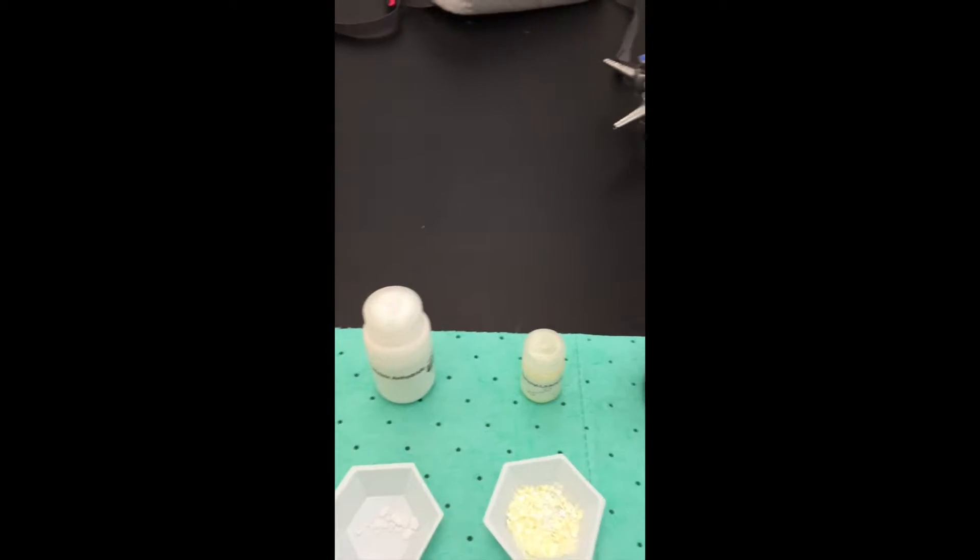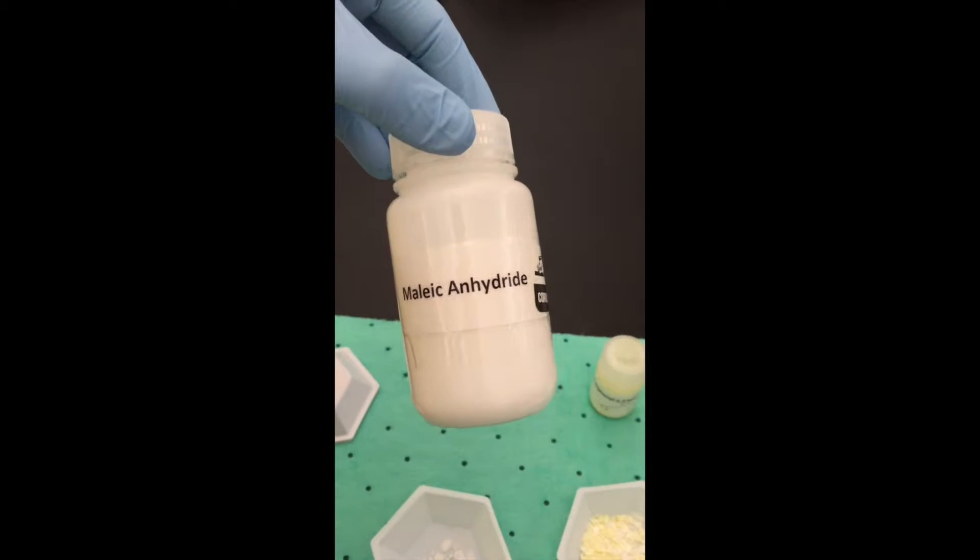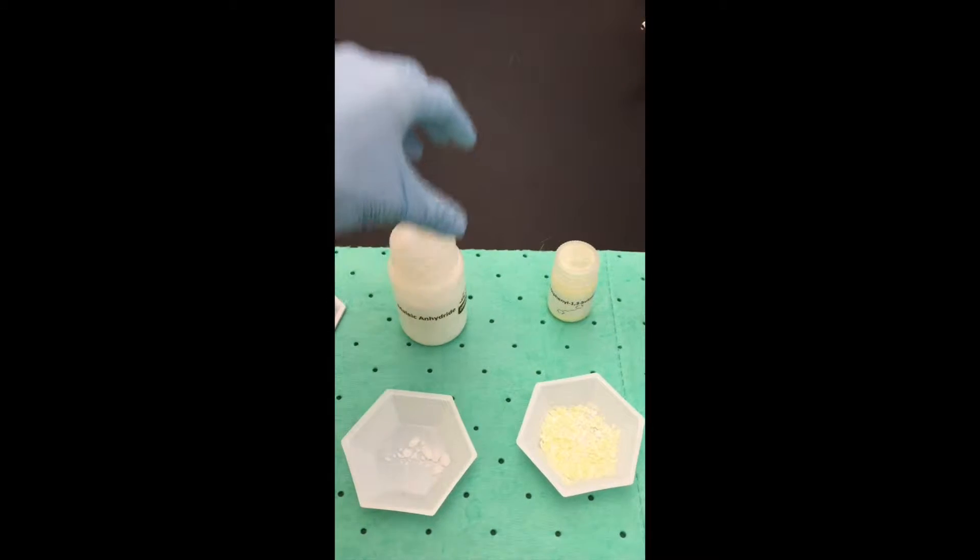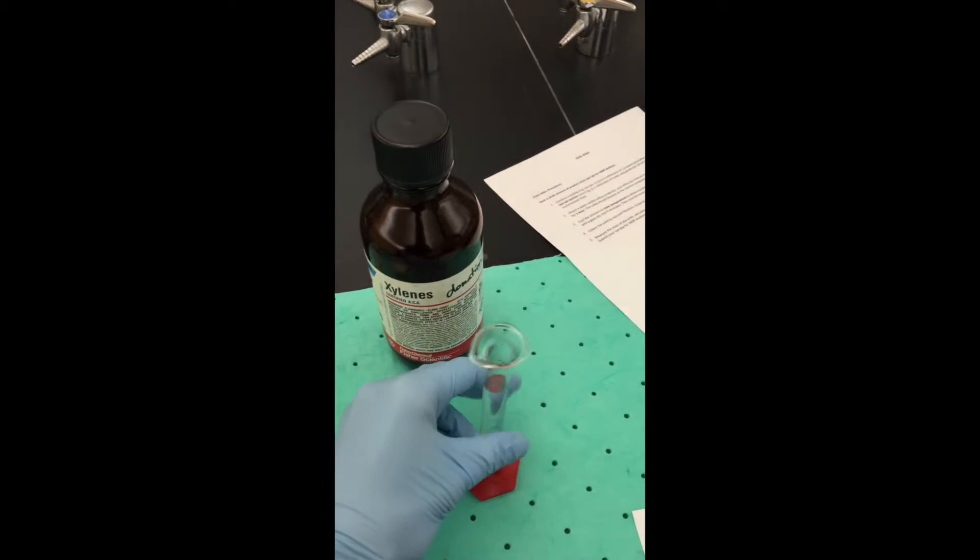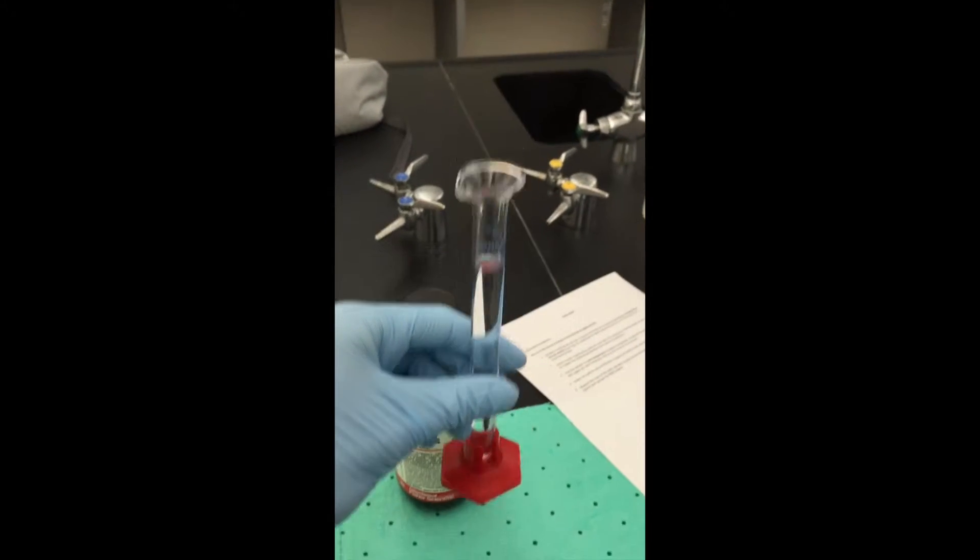We are also going to include half a gram of Maleic Anhydride. And we are going to put this into a 50 milliliter round bottom flask with 10 milliliters of xylenes.